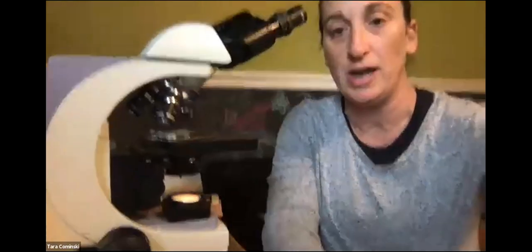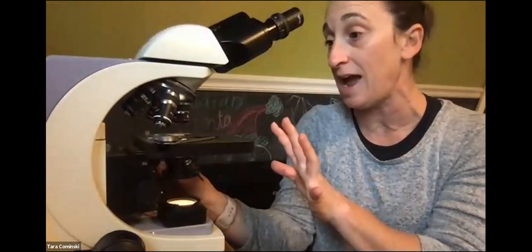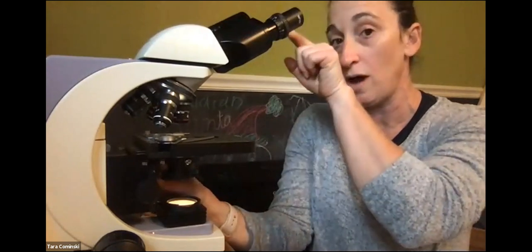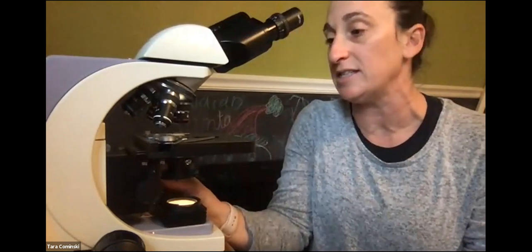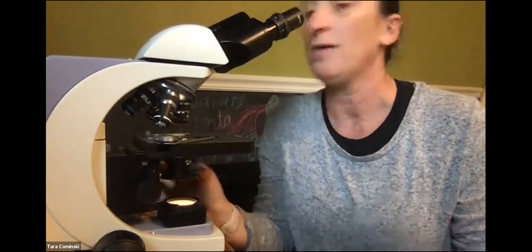So what I'm going to do now, just so you guys know, is take the mechanical stage and move the stage. If I'm looking at it with my naked eye, I'm going to move that stage to the right. But I'm going to have my video on so you guys can see what happens when you actually are looking through the microscope at that point. So let me do that. I have to share my screen again with my phone, and I'm going to show you guys that.